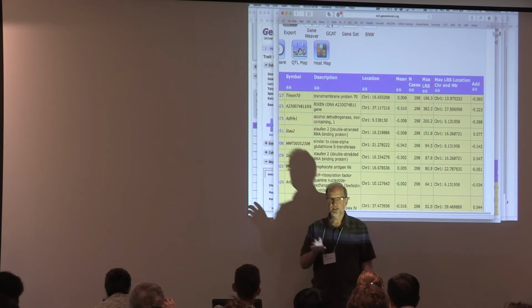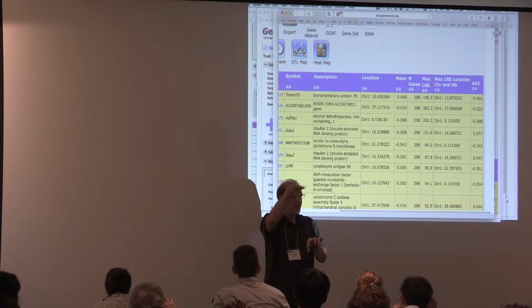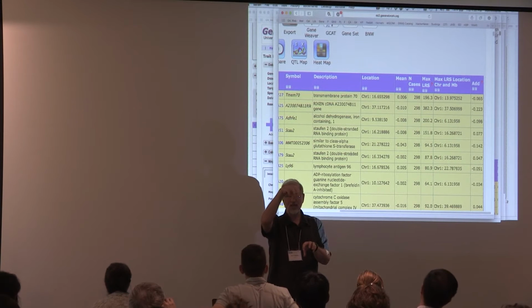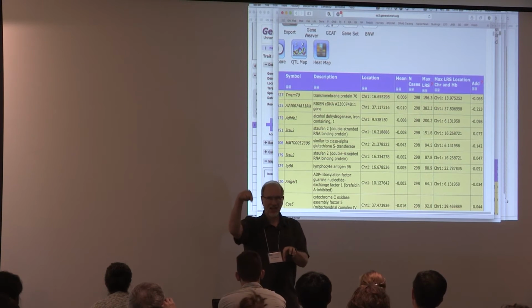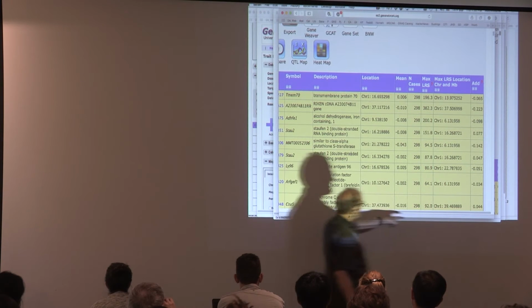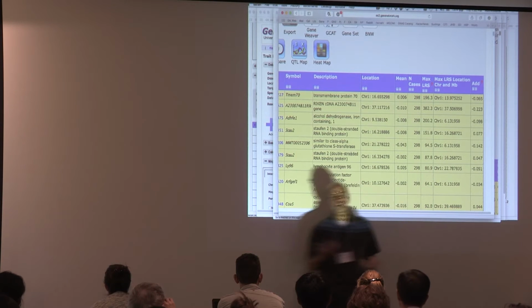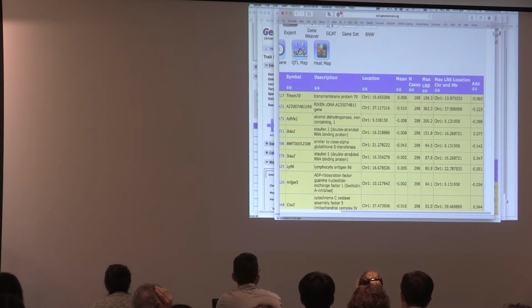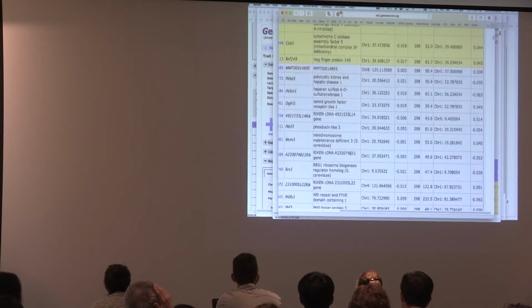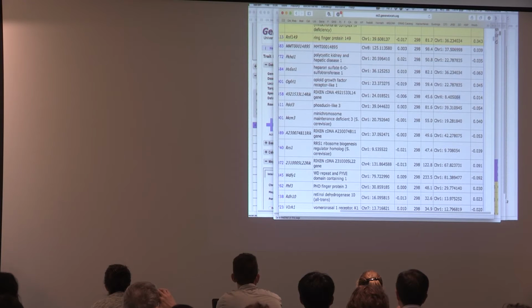It's simple. So the gene makes the mRNA. We've got the mRNA sloshing around in the liver. We measure it as a trait, and we ask, what's controlling the expression level? And in most cases here, well, in every case, it's chromosome 1. Doesn't have to be. So let's find one that isn't chromosome 1. It's good. I mean, there's no problem here. Here's one that claims to be mapping to chromosome X.